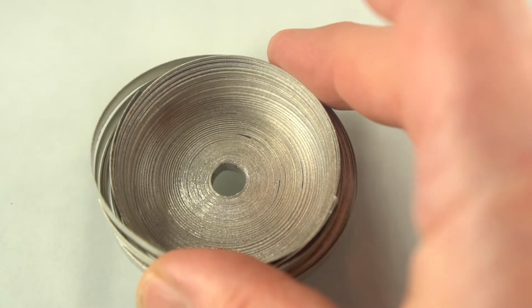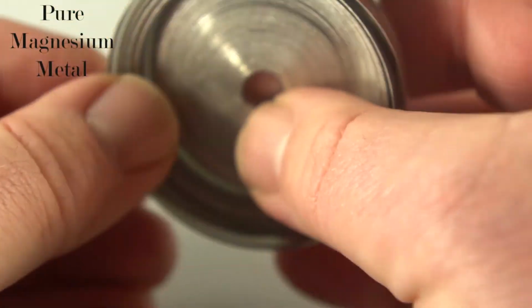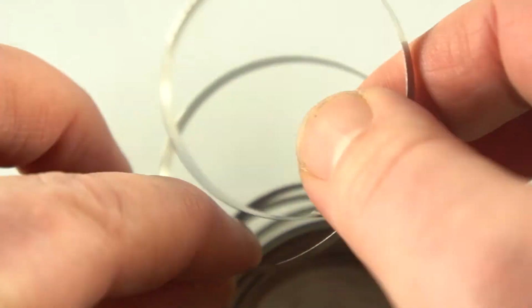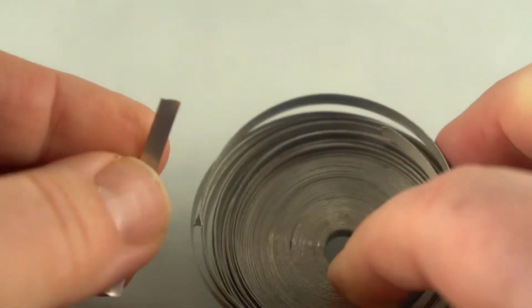Today we're going to look at 16 different reactions with the element magnesium. We're going to test its reducing power against 11 different metal cations in solution and then react it with 5 different acids. During these tests we will see a couple of very interesting surprises I think you will want to stick around for.